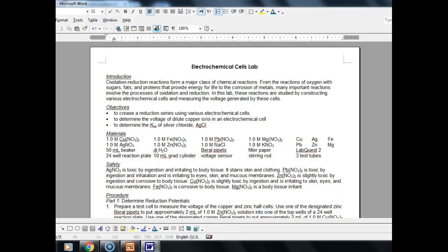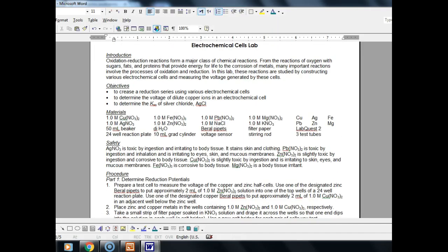Alright, this video is going to help you with the electrochemical cells lab. Before I get too far into what you're going to be doing in this video, I want to go a little bit into the chemistry behind it. This is one of the topics we weren't able to get to as much as I would have liked. So I wanted you to at least do a lab to introduce you to it, if nothing else.